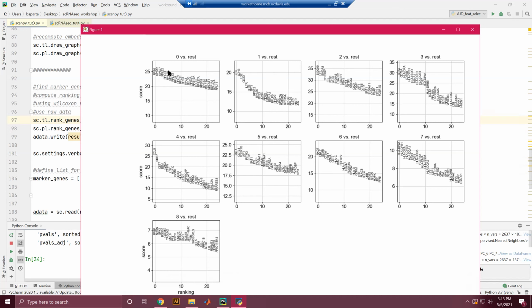cumulative set of the rest of the cell cluster groups. So these are the genes that distinguish group 0. They're mostly ribosomal proteins, so maybe this group 0 might be a more proliferative cell type or metabolically active in other ways. Whereas the rest of these gene groups seem to have more specific immune cell indications.